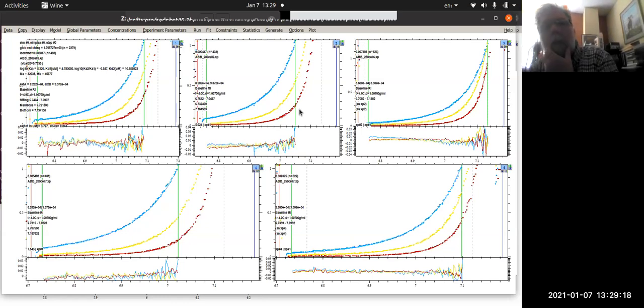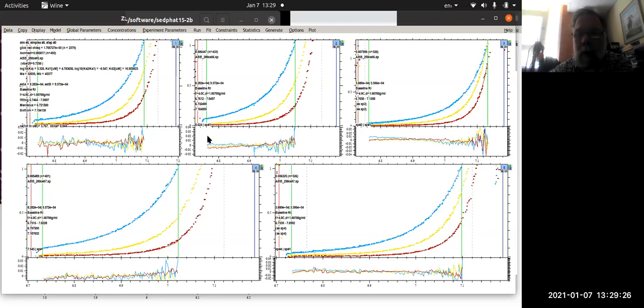And I just wanted to show you a little bit about what SedPhat is really there for and what it's designed to do. You have multiple experiments. Each one of these is a sedimentation equilibrium run that was done with a different loading. And what they probably did is they varied the ratio of A to B with a total concentration so that they could actually see the experiment, if that makes sense. And as you'd expect, if you add more B, it would promote more formation of one thing or the other.